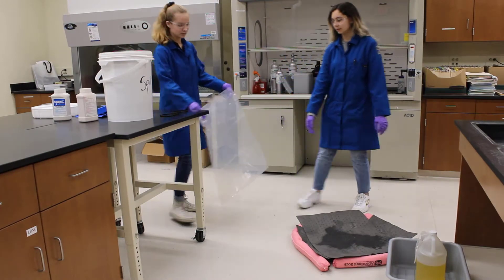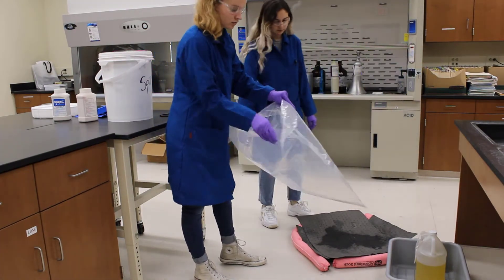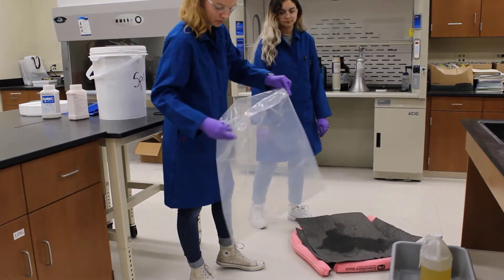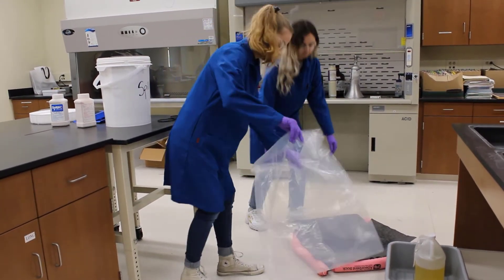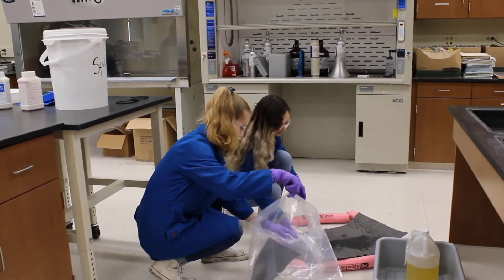When you're ready to collect the hazardous waste, use a plastic bag located in your spill kit. Prepare the bag by rolling the outside of the plastic bag down. This will help protect you in the final stage of packaging the cleanup materials.